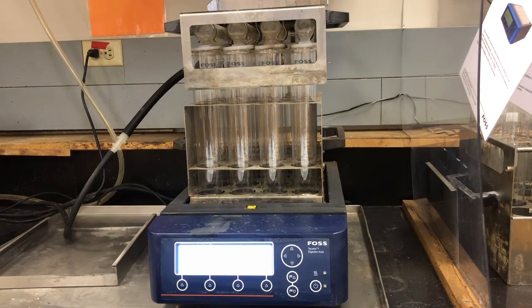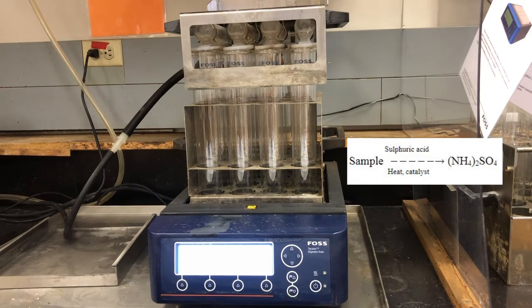This is the part of the process where the proteins or the nitrogen in the sample is broken down into ammonium sulfate. Okay, so the protein in the presence of sulfuric acid under heat and with the catalyst produces ammonium sulfate. And then when that's finished, we will go on to do the next step, the neutralization and distillation.